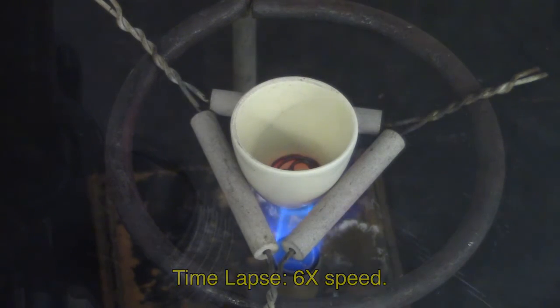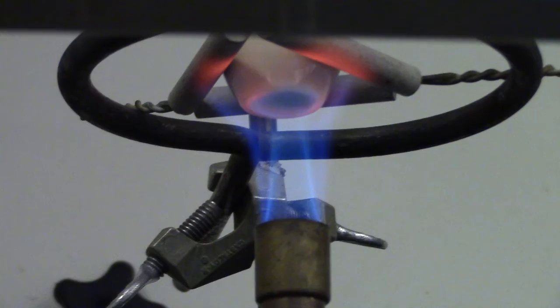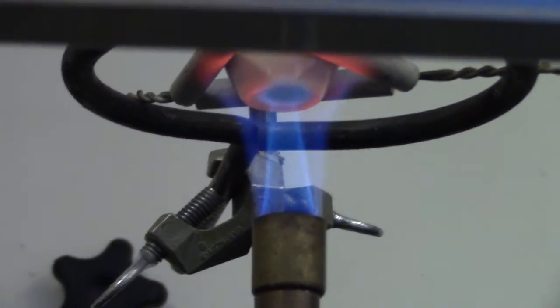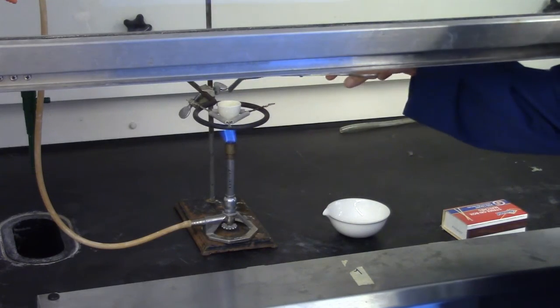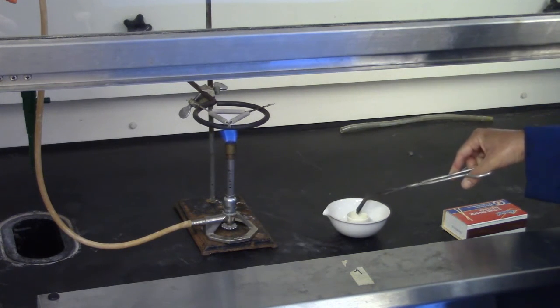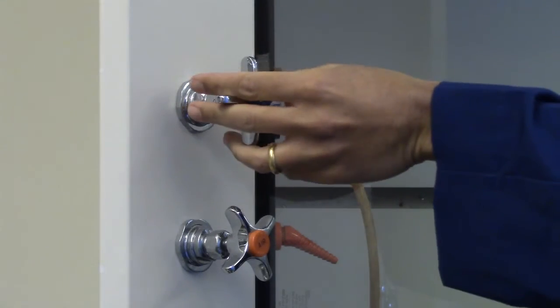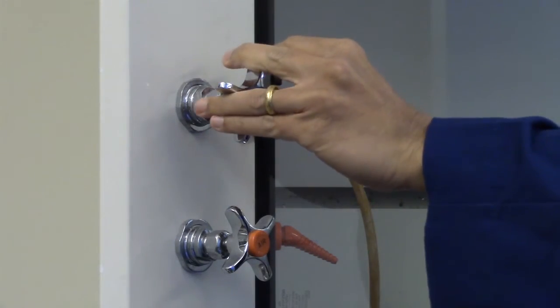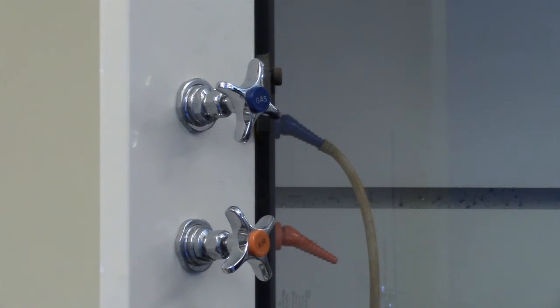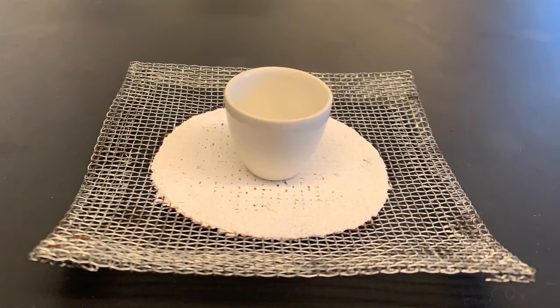Increase the heat. When the bottom of the crucible turns orange, heat for 3 minutes at the high heat. Remove the crucible from the heat and place it in your evaporating dish, taking care to not touch the bottom of the dish. Remember to turn off the Bunsen burner if you are the last student to use it. Otherwise, leave it on for the next student. Return to your bench with the crucible. You may let it cool in the evaporating dish or place it on your wire gauze.